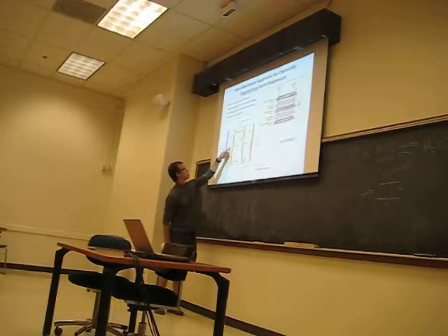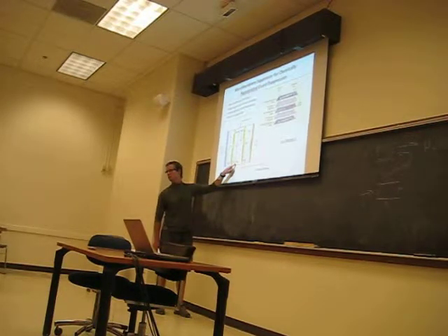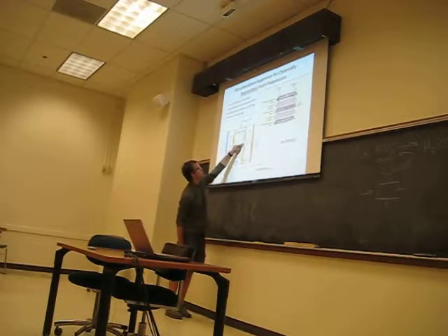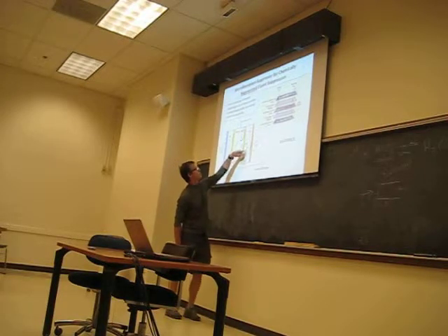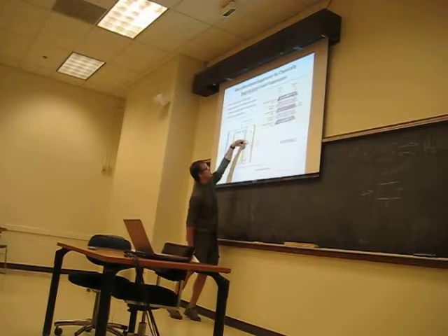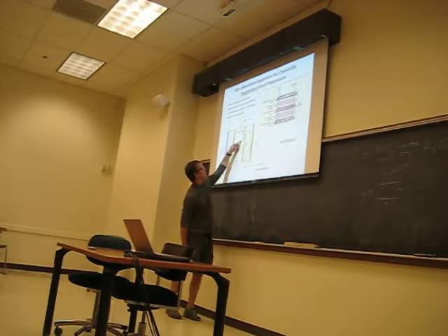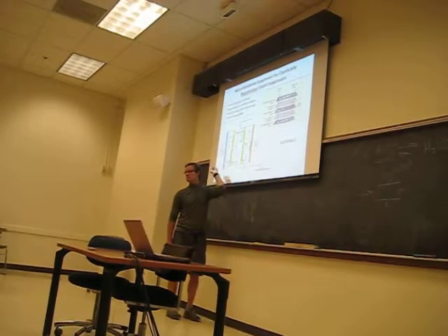eluate is going. Those protons then combine with the bicarbonate to form carbonic acid, which is no longer conducting. Okay. The sodium cations are able to diffuse across the membrane, because they're also ions that would contribute to the conductance in the detector, diffuse across the cation permeable membrane, and essentially into this regenerated space, they're being drawn by electrostatic attraction to the high hydroxyl anions in here. They diffuse across into this space, and they're essentially flushed out and regenerated.